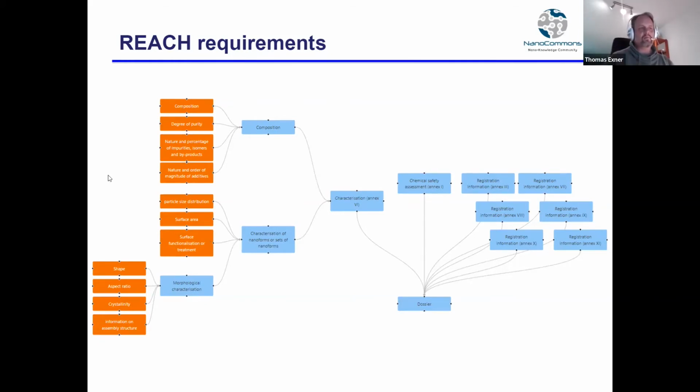This is now only for the physicochemical characterization, but you can also give the information, okay, what is your yearly tonnage? One ton. Okay, then all these things, don't worry about them. They are not relevant for you. Just to show a little bit where we are thinking this might work, and in principle, to not make that too complicated, we would then also link to smaller instance maps.